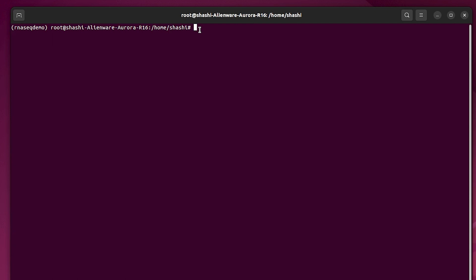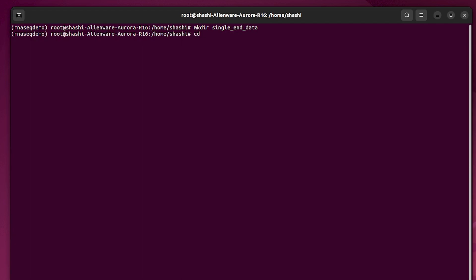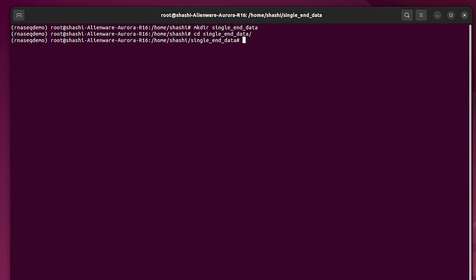Now I'm going to show you how to use the SRA tool to download RNA-seq data using the SRA ID. First I'm going to make a directory in which I will download the RNA-seq data: 'mkdir single_end_data', then change into that directory. Now we are in the single_end_data directory. There are two types of RNA-seq data: paired-end or single-end. In single-end RNA-seq, only one primer is used for sequencing, but in paired-end there are two primers — forward and reverse — both used for sequencing.